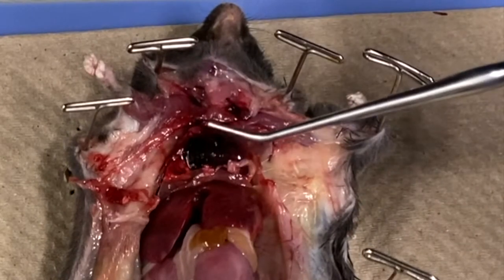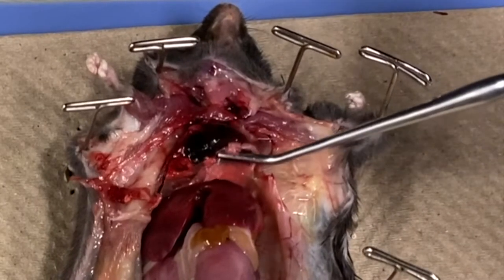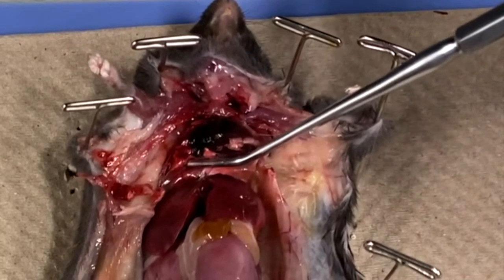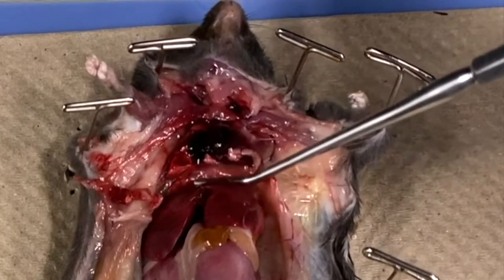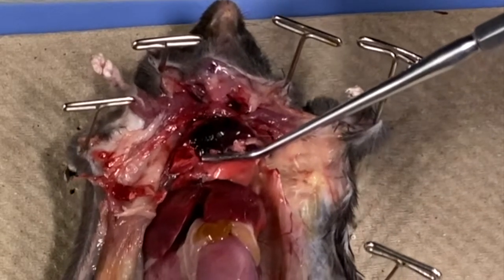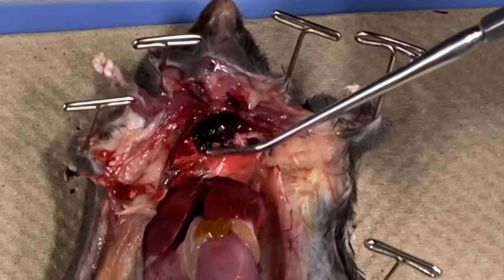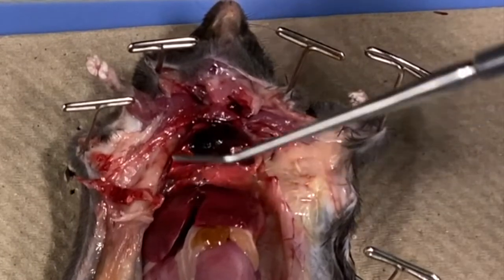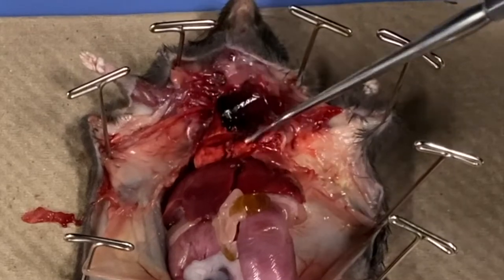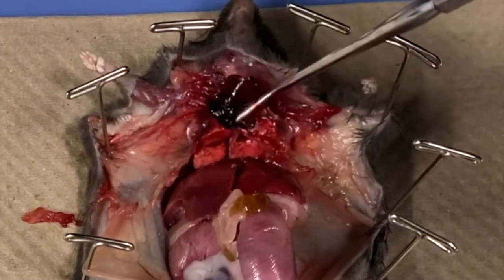The heart should now be visible. You may also see the diaphragm, a thin muscle that separates the abdomen from the chest. It contracts when the mouse inhales, creating a vacuum that pulls air into the lungs, and then when the mouse exhales, it relaxes and the air is pushed out. The lungs should now be visible. The right lung consists of four lobes, while a single lobe makes up the left lung.